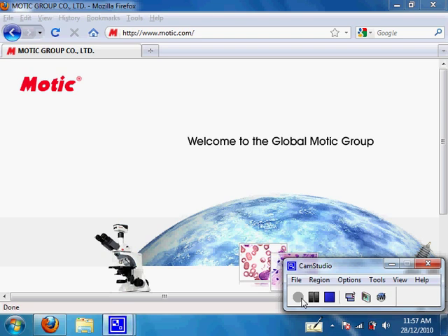Hello, this is a tutorial video on how to install the correct driver for Windows 7 and Windows Vista for your Motic Cam or Motic microscope. Please make sure that your Motic Cam or microscope can work with Windows 7 or Vista. The easiest way to check is to check on your CD — if it says Vista compatible, it will work on Windows Vista or Windows 7.